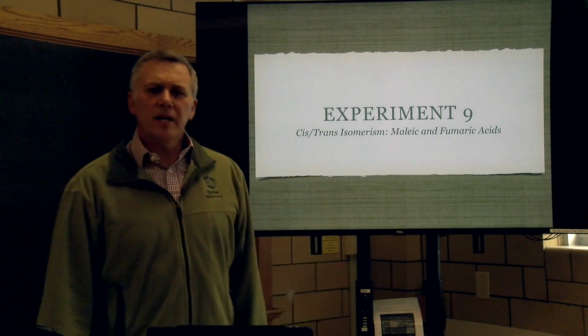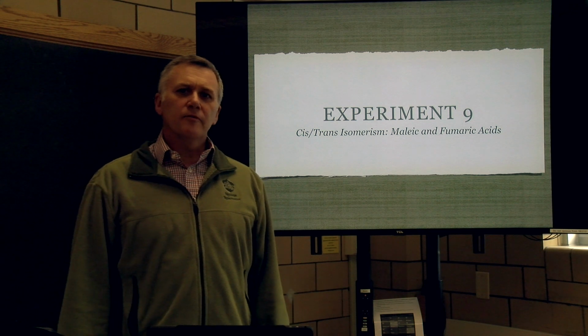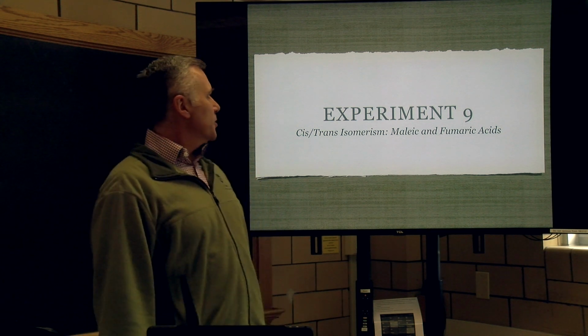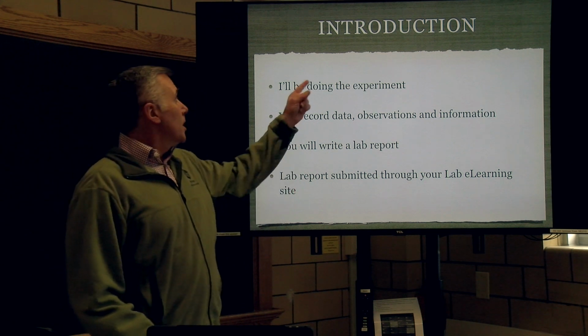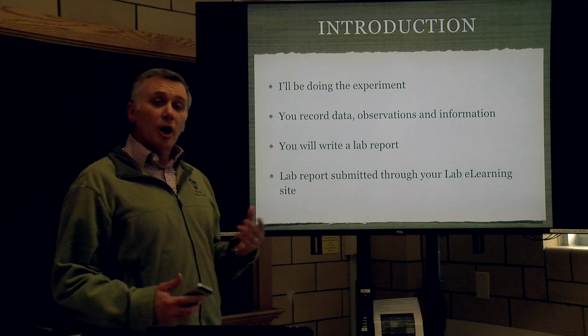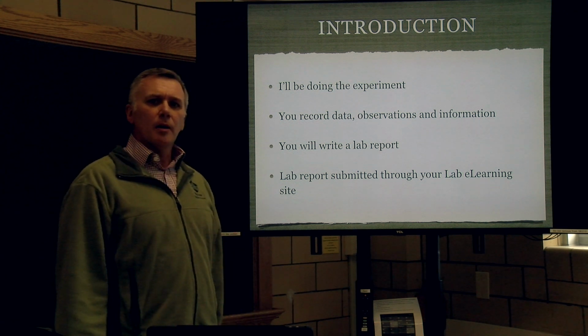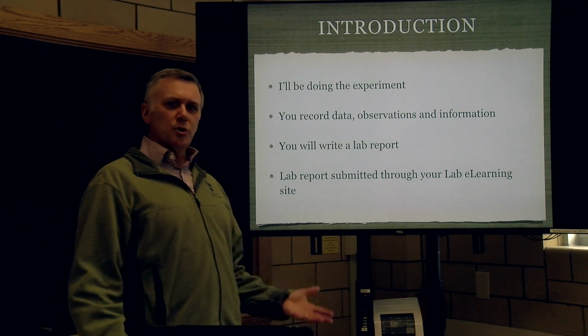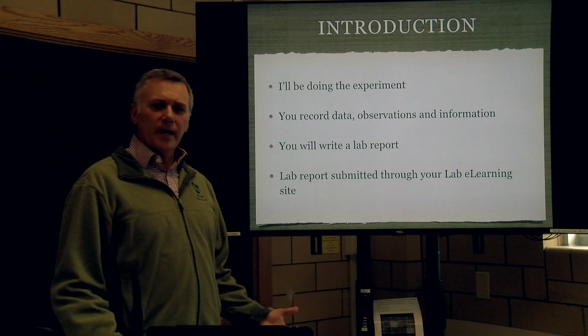Students, welcome to lab. Today we're going to deal with cis-trans isomerism, and that deals with maleic and fumaric acid. So, remembering a couple of things as we introduce the experiment: I'll be doing the experiment. You're going to be watching, but you'll be recording the data, observations, all of those types of things, doing any calculations, making decisions about when melting points occur and that type of thing.